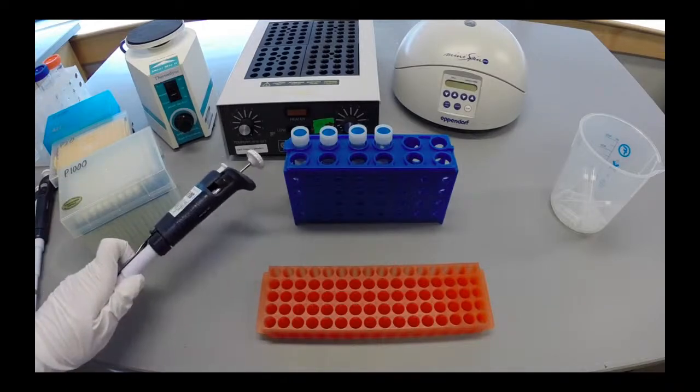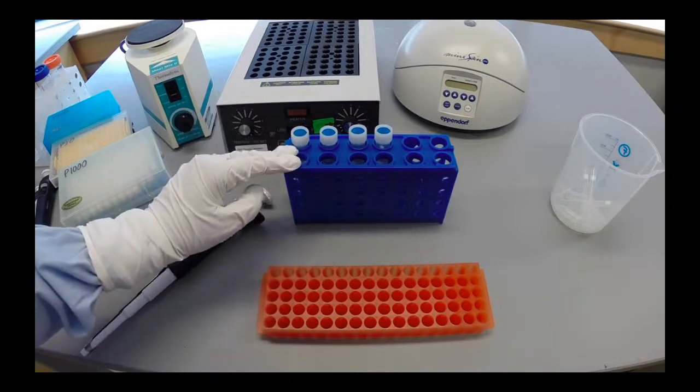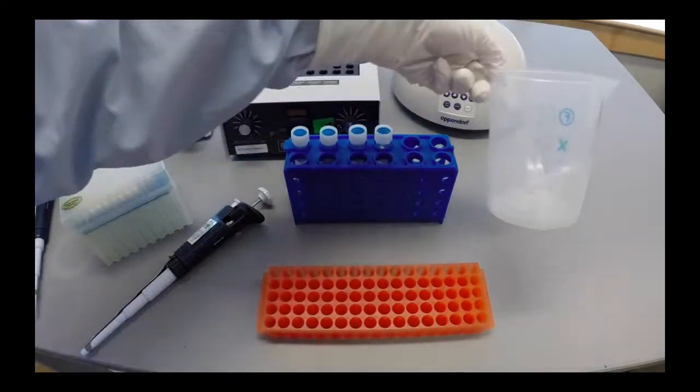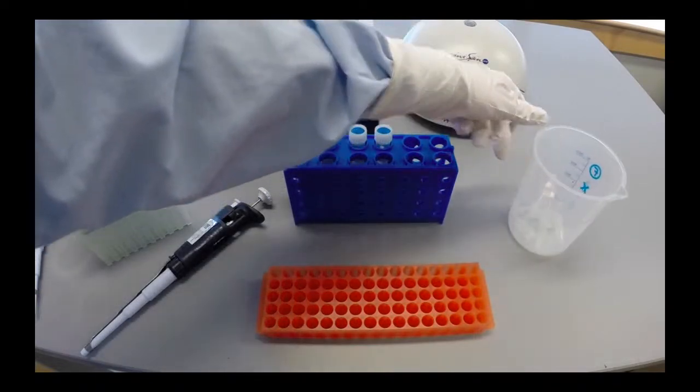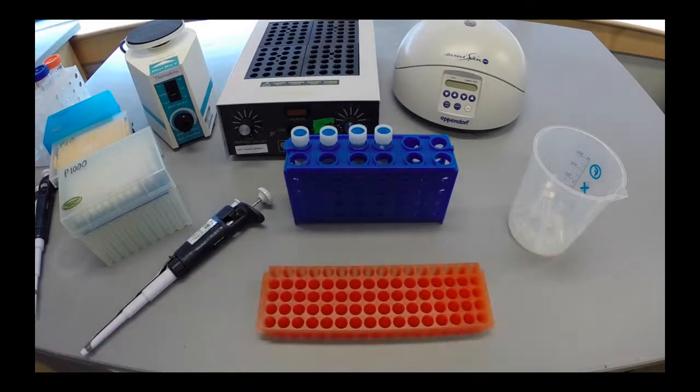Tips and pipetters are on the left, racks and samples are in the middle, and the discard bucket is on the right. As your hand moves through the flow, it never unnecessarily crosses over the sample again.